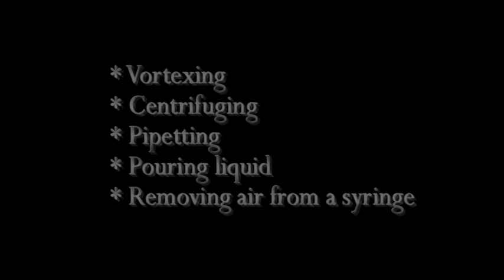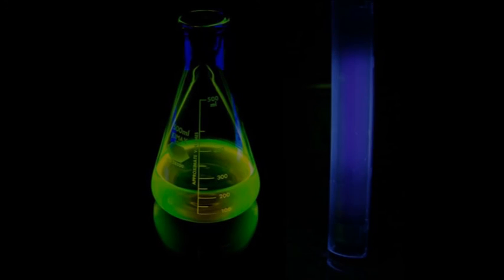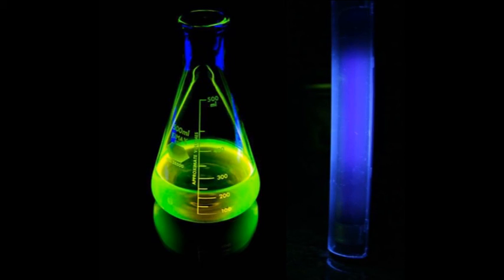Therefore, leaks or escape of aerosols were mimicked using fluorescein as an indicator added to water while performing the procedure. Presence of fluorescent splashes was then seen on surfaces by using an ultraviolet lamp. In this movie, aerosols could not be clearly visualized. Therefore, whenever splashes are seen, one should always keep in mind that aerosols are generated as well.